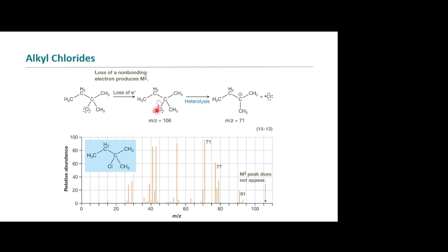And it comes off of this chlorine right here, which then ends up pulling electrons from the carbon and can then leave, because that's going to make it a pretty good leaving group, isn't it? Okay. And so you see that one of the resulting fragments that ends up being very large amount of the sample is actually just the loss of the chlorine, isn't it?